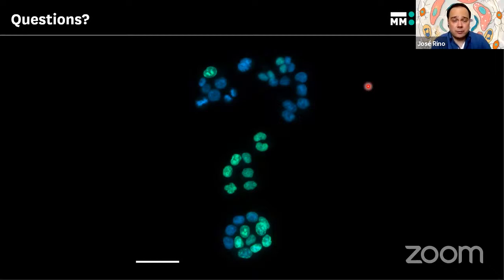On the point scanning confocal, you can choose the frame size and the number of pixels, because you can choose the number of points that you're scanning in the sample. So it's much more versatile, and you can match that to the objective and the field of view you are using. On a confocal you can really fine tune it, while on a spinning disk you're limited to the camera and the pinholes.